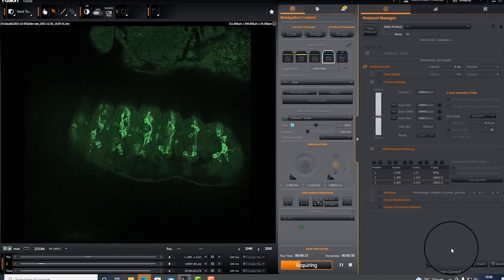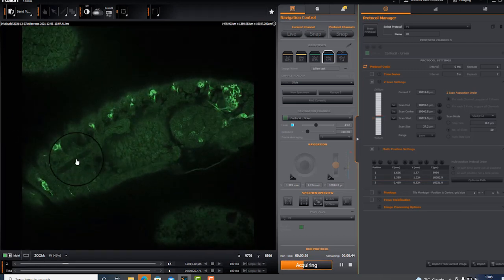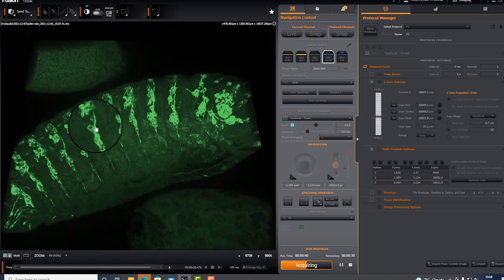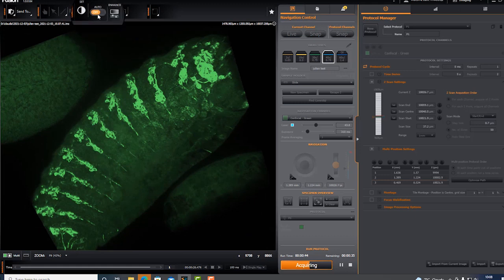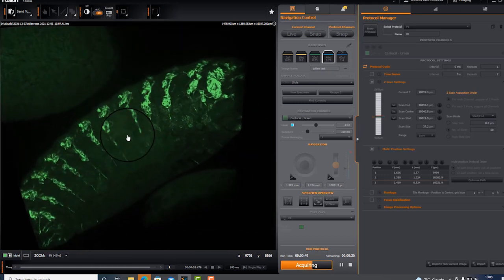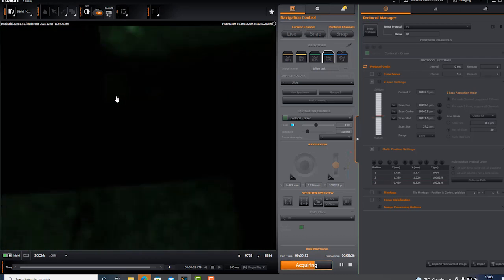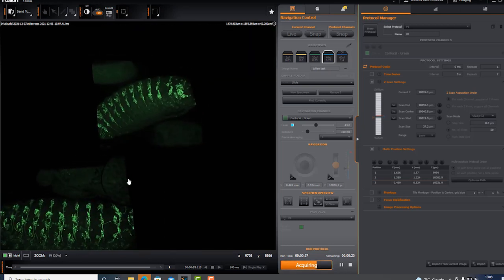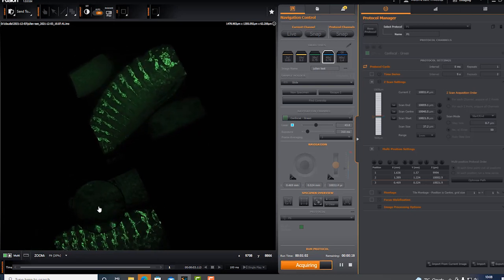So now we're going to the second position. We can press display to see all the positions. You can also see the embryos in 3D. You can press on auto map for better mapping. And this is, I love this staining. This is actually very wonderful. Oh, now the second position is there, so you can see the 2 embryos still in 3D.